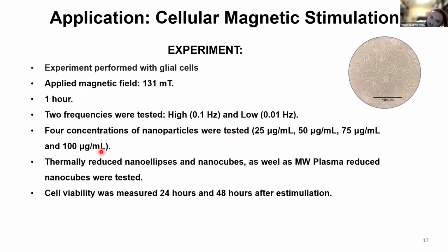And we measured the cell viability 24 and 48 hours after the experiment.